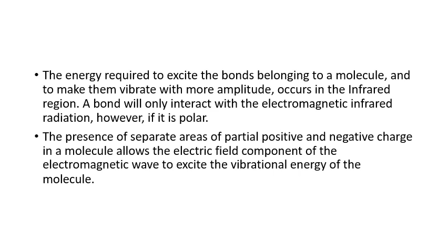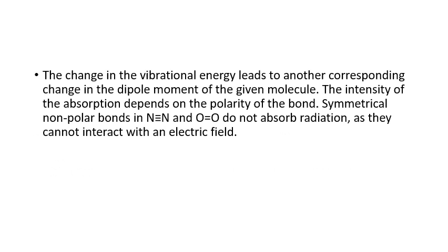The presence of separate areas of partial positive and negative charge in a molecule allows the electric field component of the electromagnetic wave to excite the vibrational energy of the molecule. The change in the vibrational energy leads to a corresponding change in the dipole moment of the given molecule.